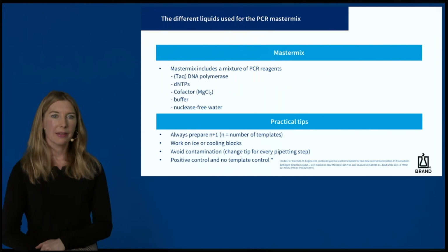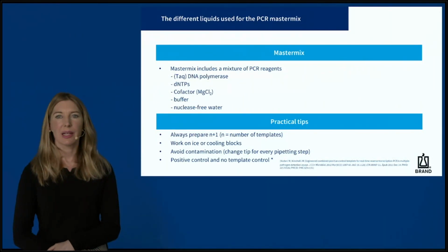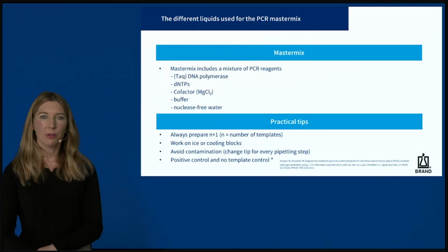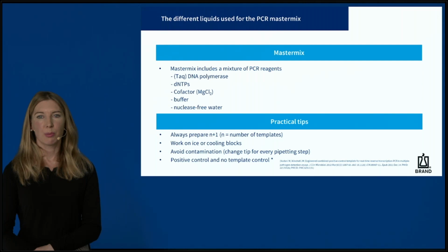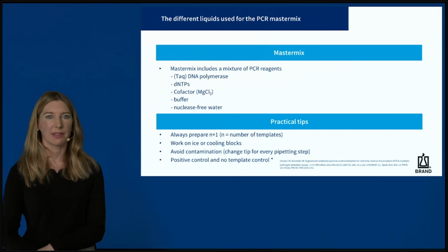But regarding our master mix, finally, we have to add template DNA, which contains the target region, and primers. The PCR preparation should be done on ice, for example, with the help of a cooling block. For qPCR, dyes like SYBR Green and strand-specific probes must be added. Always add a positive control and a no template control with your PCR run to ensure the reliability of your results.